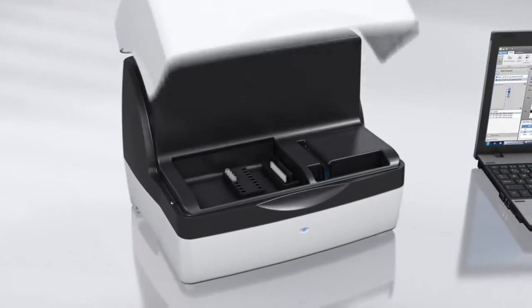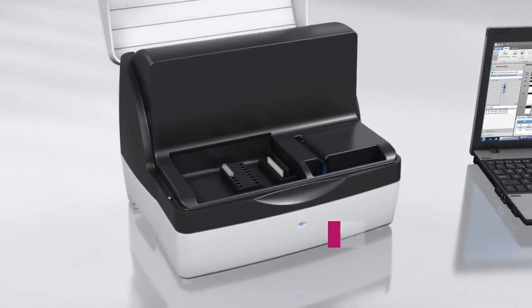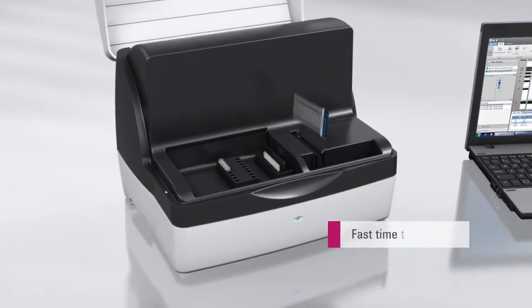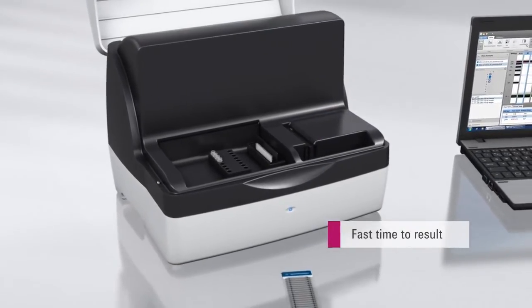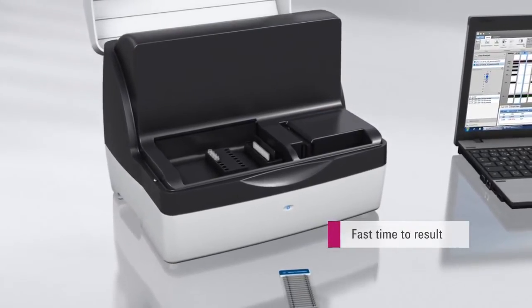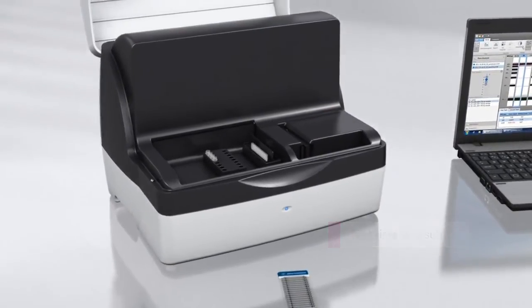Results are available in approximately 1 minute per sample, regardless of the total number of samples being analyzed.